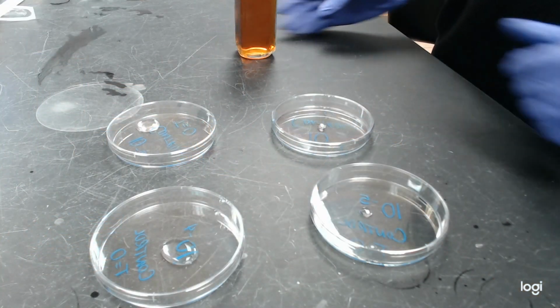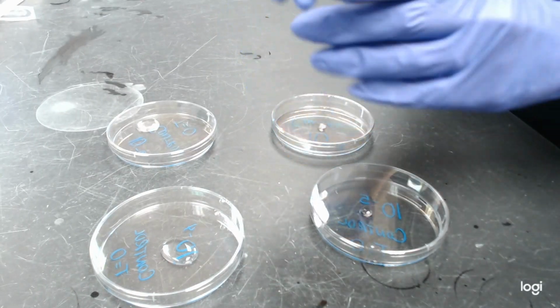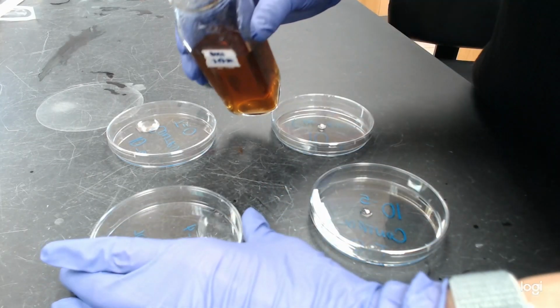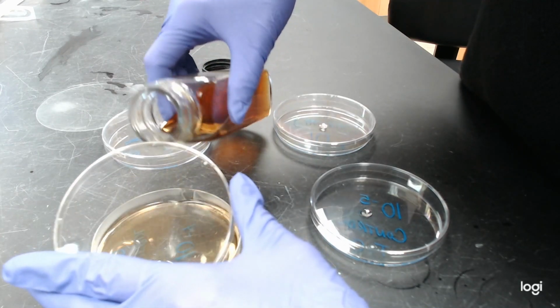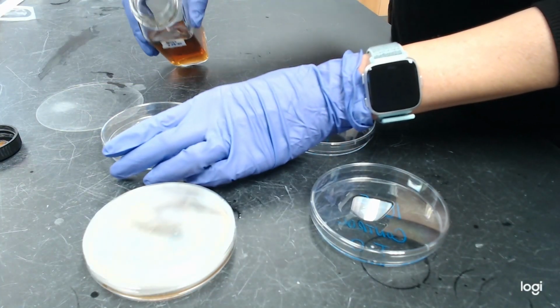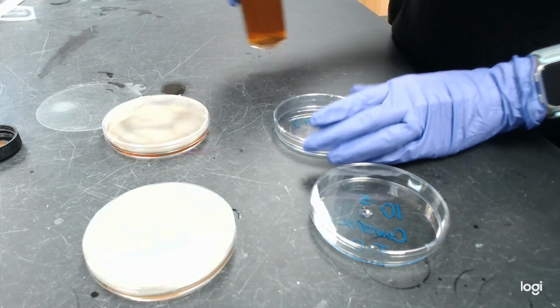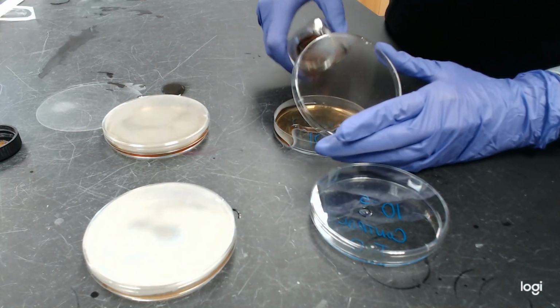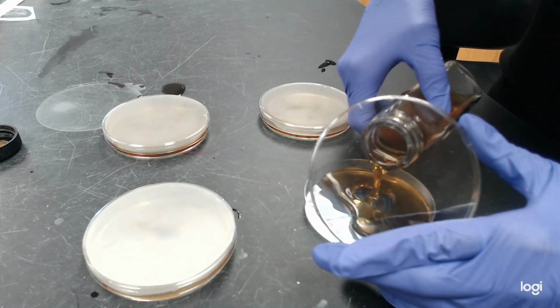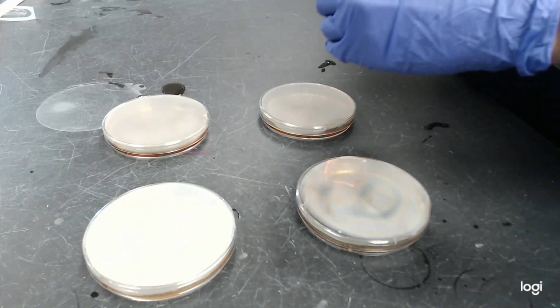Okay, so I have my pour plates ready to go. I just need to add my agar. I've taken it out of the incubator and let it cool off a little bit. And now I'm ready to make my pour plates. Typically you'd be getting some help with this, but I am all alone here, so making a little bit of a mess. Okay, so I'm going to let those harden.